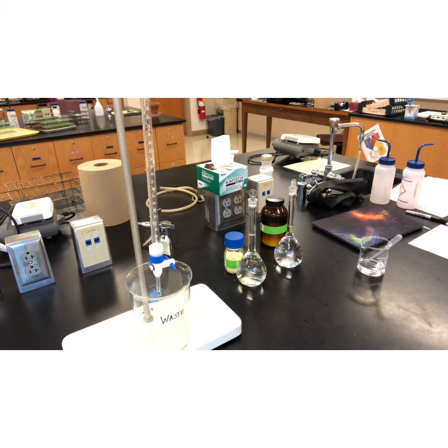Let's look at part C now. Yep, and I told you, this tells you to consider your atomic weights and your volumes and masses that we took. How many significant figures can you claim? So you should be able to figure that out. All right, part C.